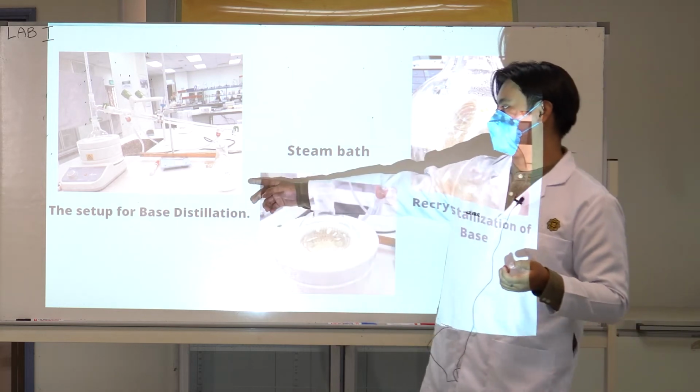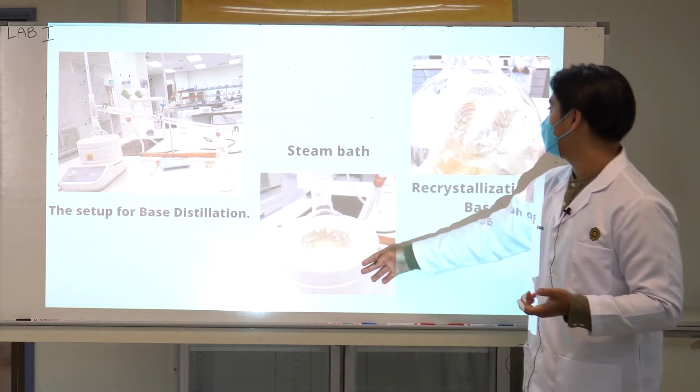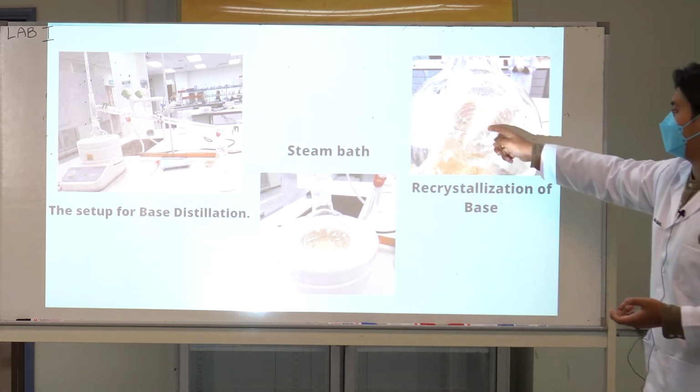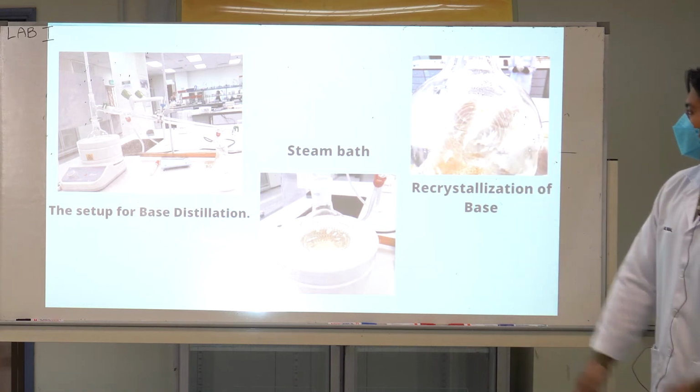So this is the setup of base distillation. This is the steam bath, the white one, and this is the recrystallization of base. You can see that it's like a spider web, I think, and this is the base one at the bottom.